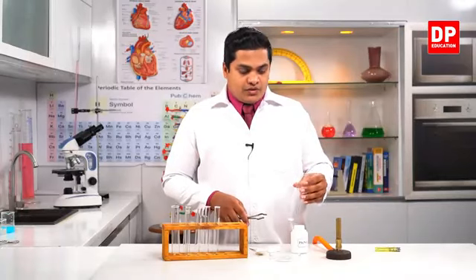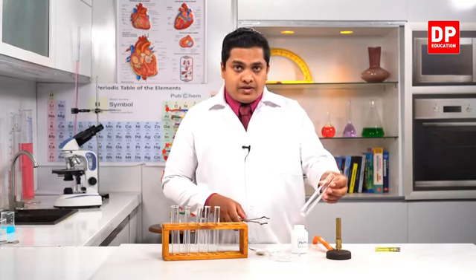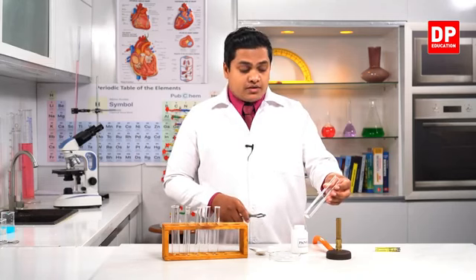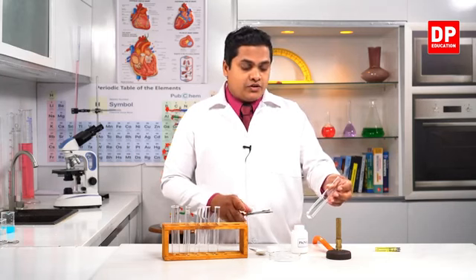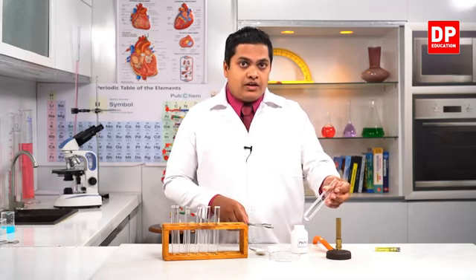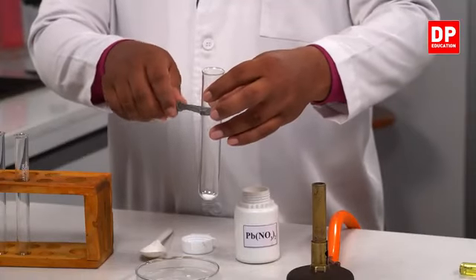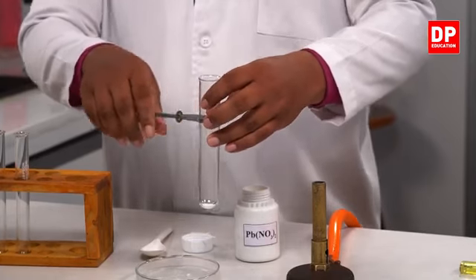Right, so I have used a small bit of lead nitrate, because when I'm going to heat this, a somewhat toxic gas is going to be emitted, right? So I'm heating just a small bit of lead nitrate. Now I'm going to hold this by using the holder and let's heat the system.